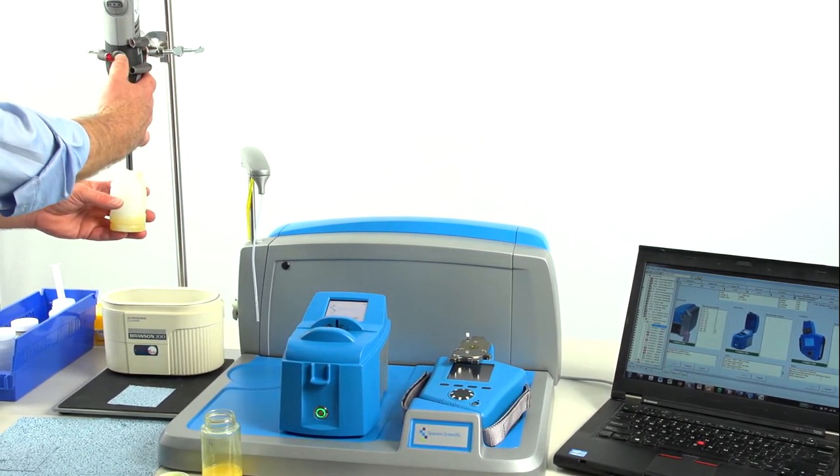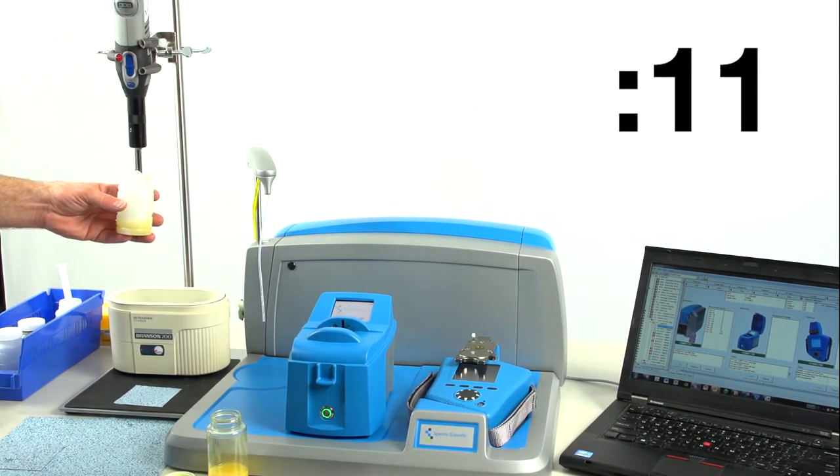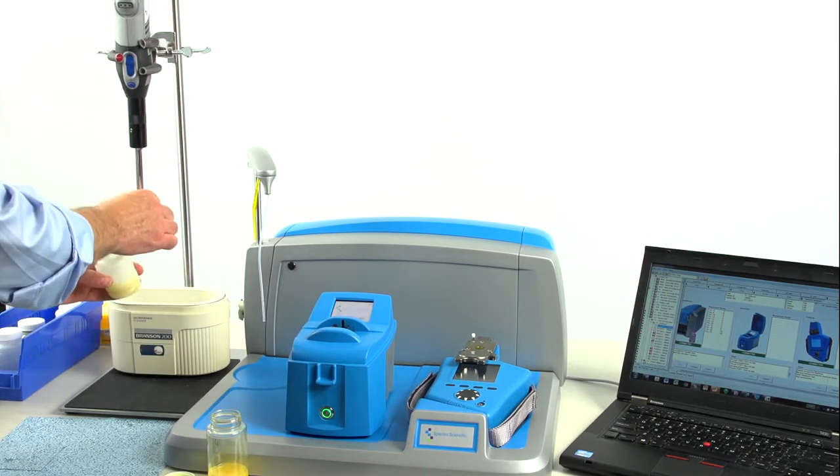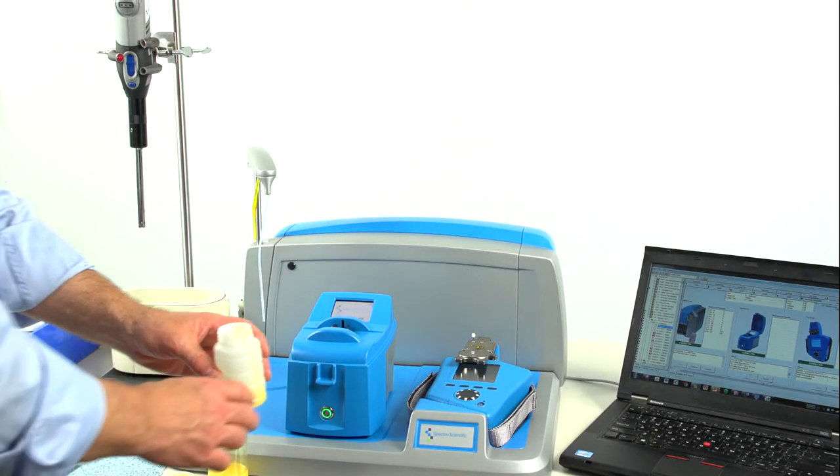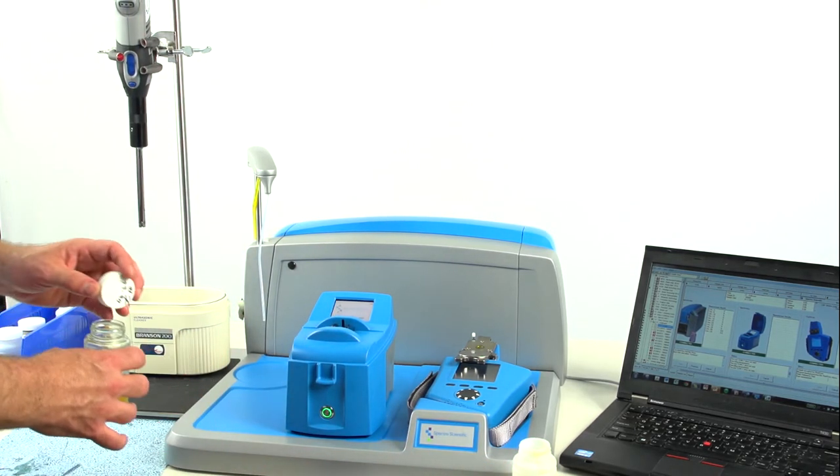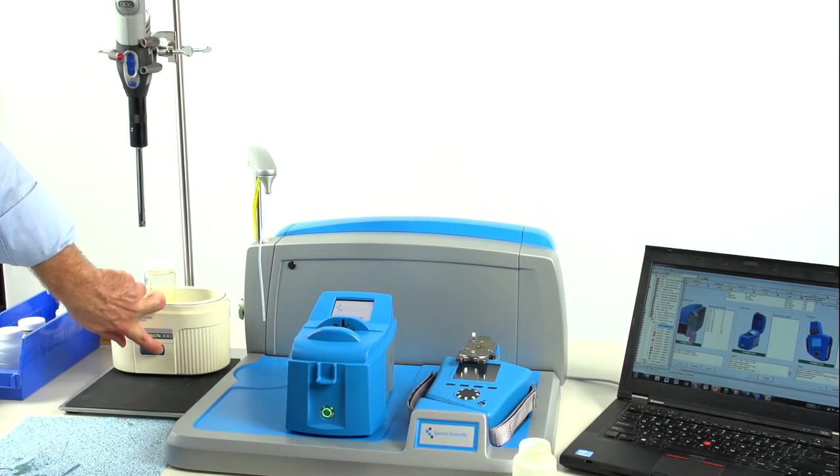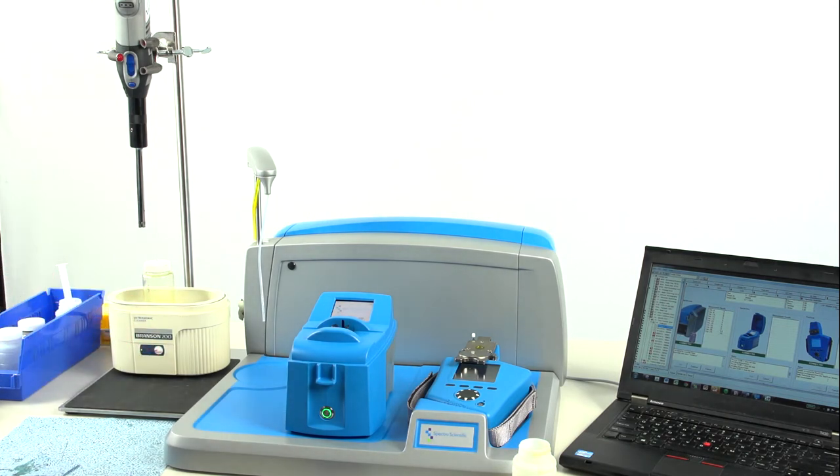The patent-pending technique homogenizes the sample. We let that sample sit for a minute before running it in the FluidScan. In the meantime we can take the rest of our oil sample, put it in an ultrasound for 30 seconds. That removes any air bubbles introduced during the shaking process.